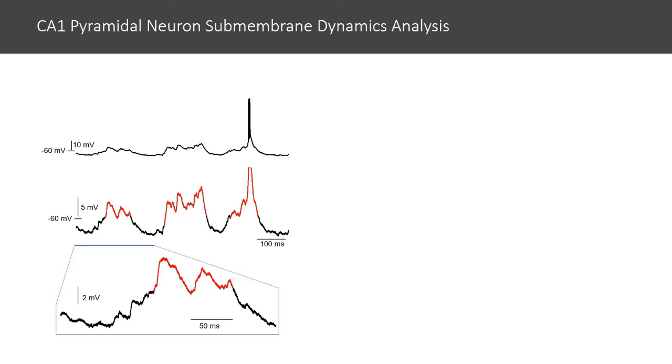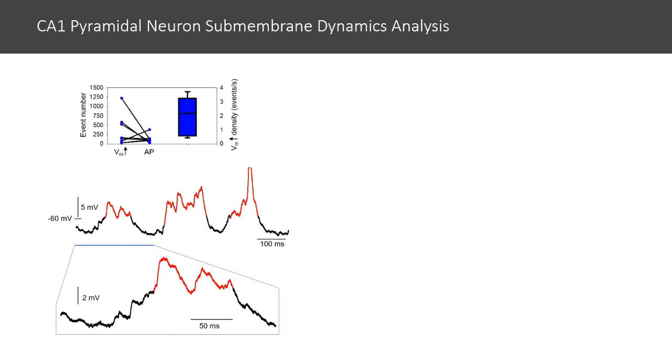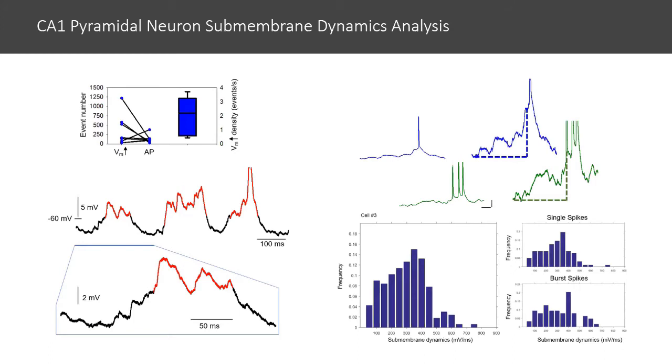To further analyze this, we define a membrane depolarization epoch whenever there was an increase of 10% over membrane potential baseline. If we zoom in more, as shown in the bottom panel, we could even appreciate single fast events, presumably synaptic inputs, which produce these membrane potential depolarizations. In the top panel, you can see now that the frequency of these events is much higher than the occurrence of action potentials, and our preliminary analysis shows that they are theta frequency modulated. These submembrane dynamics that give rise to action potentials are analyzed on the right-hand side of the slide. To this end, we focus on the 100 milliseconds that preceded each isolated action potential and quantify the development of membrane potential until the occurrence of the spike.